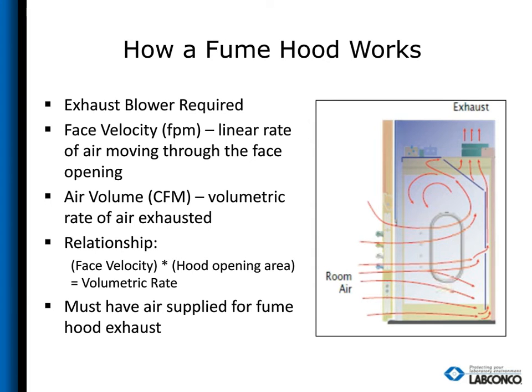The room air is going to be pulled through a fume hood via the blower and exhausted outside. We measure that air that is exhausted in a few different ways. First, there is the volumetric flow of air. Basically, we are going to take an amount of air and pull it through the fume hood opening and vent it outside. The volumetric flow is typically measured in cubic feet per minute, or CFM for short.